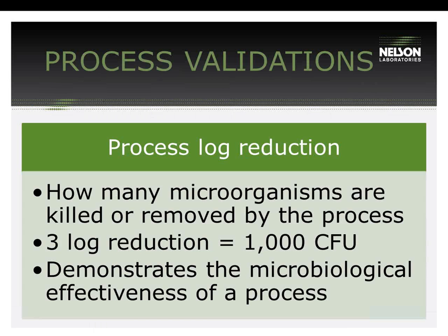Now, oftentimes when we're talking about process validations, a very common term from a microbiological standpoint is a log reduction. I want to make sure that concept is clear before I go into my next slides and before Alpa goes into hers. So the term log reduction just means how many microorganisms are being either killed or removed by the process. For example, a 3-log reduction means that you have killed or removed 1,000 CFU.